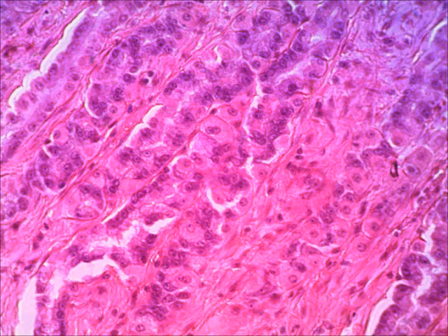Now, this last slide of the stomach is going to show the gastric glands. You can see just some of the details of the cells of the gastric gland. If it will move, I've clicked it. Here we go. Now, I know I don't expect you to know it from this magnification. You need to be able to recognize it by seeing gastric pits. But just for extra information, and this especially goes along with your lecture, you might recall that within the gastric glands you have chief cells and parietal cells. You can actually see the difference in the two on high power with the microscope.